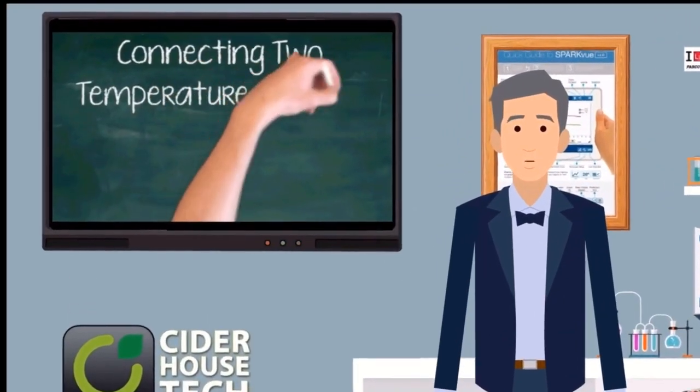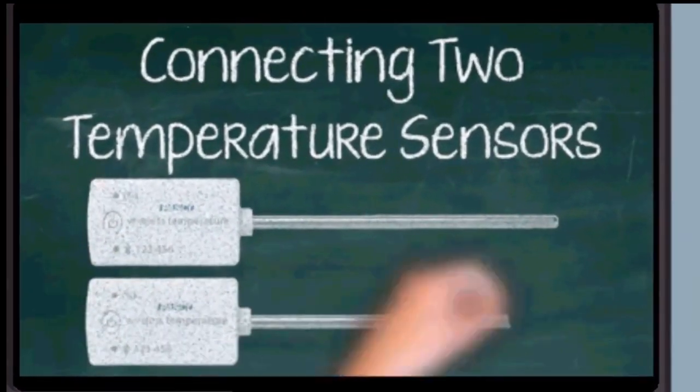I guess I'm right. Okay, so I'm just going to run a video that I created showing you how to use more than one sensor at a time. You can use up to about 6 if you wanted to. That's no issue at all. Sometimes you can even use more, but 6 is what you'll see on the one display anyway. So here it is using temperature sensors, 2 at a time. We will now look at displaying 2 temperature sensors on the same page or display.